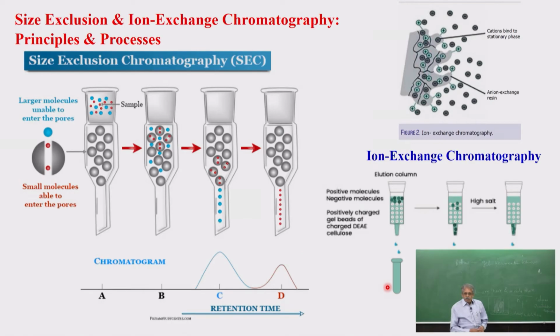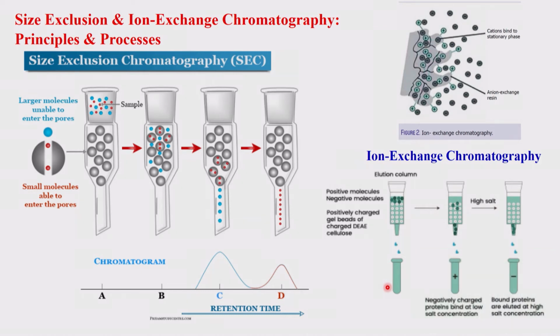Hope that is clear. If you go to higher molecular weight species, there are quite a few methods. I talked to you earlier about one, which is based on size difference or size variation, and that principle is called size exclusion.